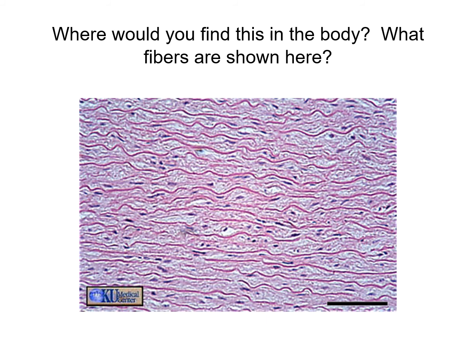Is that ground substance? No. Hold on. It is actually elastic tissue that you would find in elastic arteries like the aorta. So those wavy fibers would be found within the tunica media.